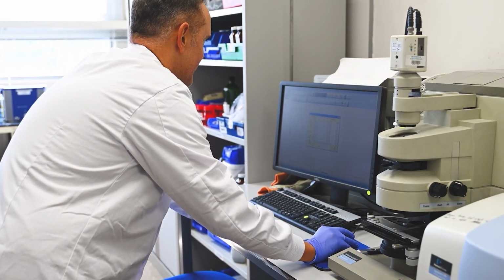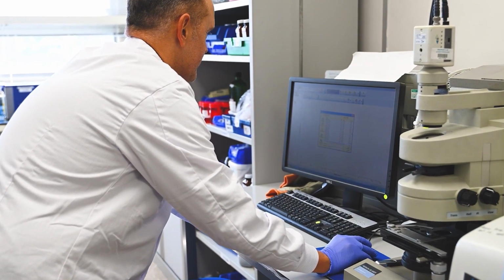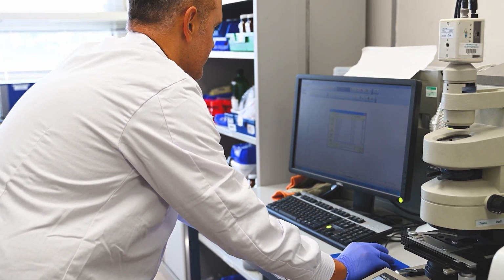We've worked with small particles which are taken out of vaccines. If you've got a vial of liquid vaccine, any particle there will fail their quality control. So we can work with minute particles as well as bulk contamination dusts. The infrared will give us a nice fingerprint, and that will tell us what kind of organic materials, polymers, things like that could be present.